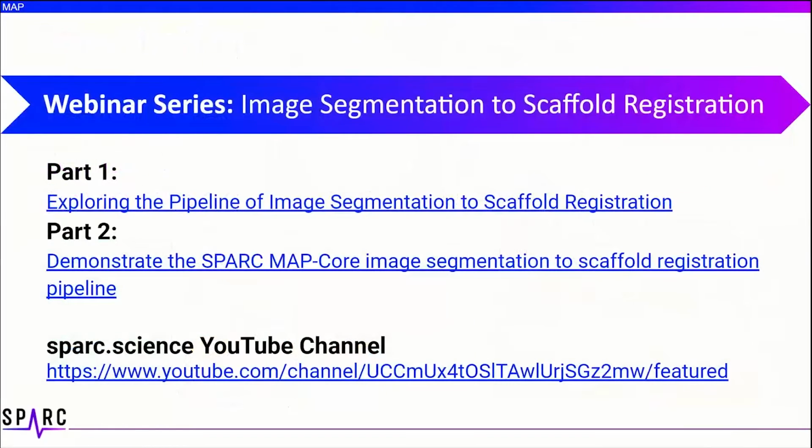We hosted a webinar series last month that detailed the image segmentation to scaffold pipeline. In part 1, Aidan and I demonstrated how to use FAIR segmentation tools in our software to create and prepare files for scaffold integration. If you'd like to learn more, we encourage you to please visit the sparc.science YouTube channel, and you can check out part 1 and part 2. But today we're going to take a closer look at how easy it is to access anatomical vocabularies from within our software and use MBF segmentation and editing tools to add metadata to existing files.